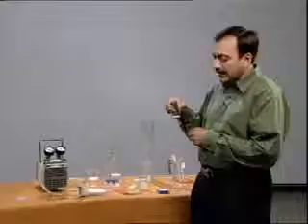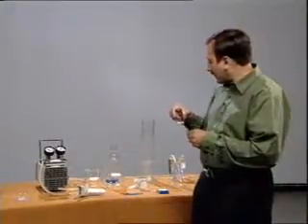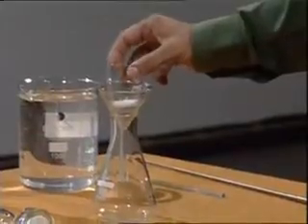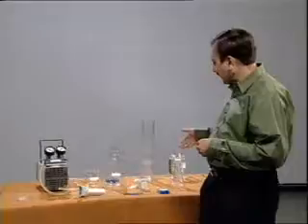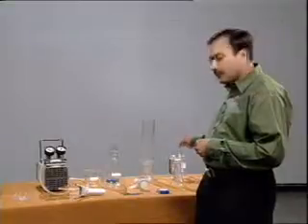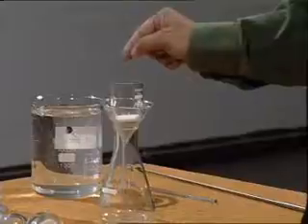Now, this can be placed on a flask of suitable size, or alternatively you can use any conical flask and through the funnel it can be placed. The water sample is filtered and the amount of suspended impurities retained on the crucible is measured after oven drying. The pore size of the crucible is 1.2 micrometers.